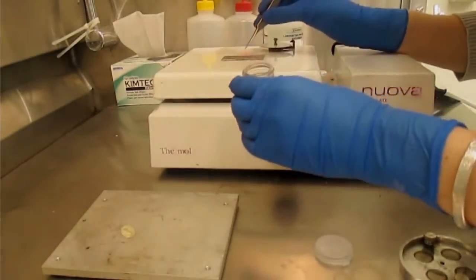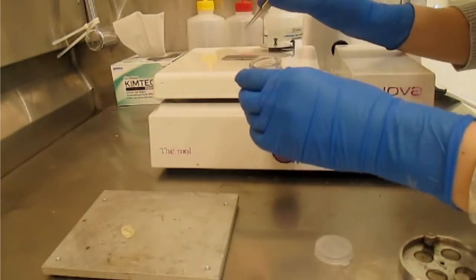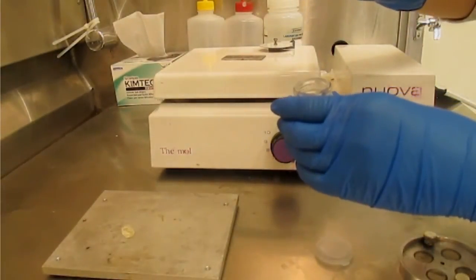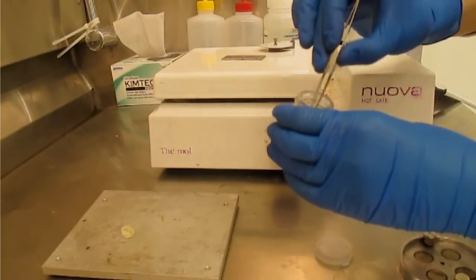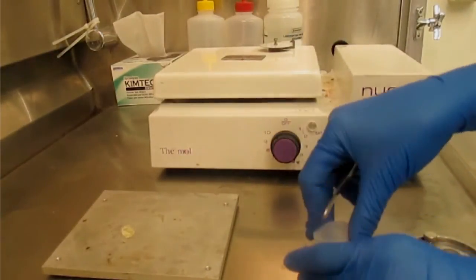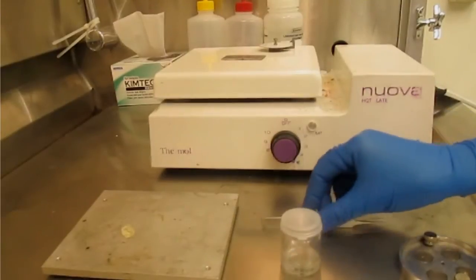Once the crystal bond adhesive melts, use tweezers to gently release the disc from the specimen plate. Soak the disc in acetone for at least 30 minutes to remove the crystal bond adhesive.